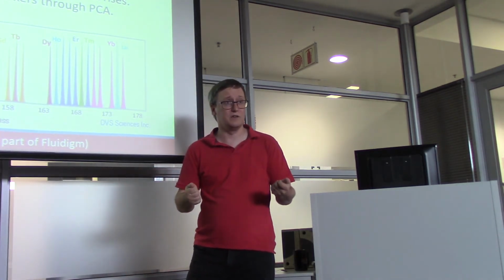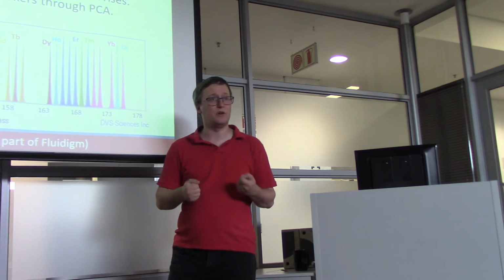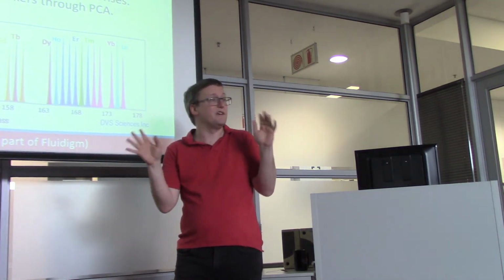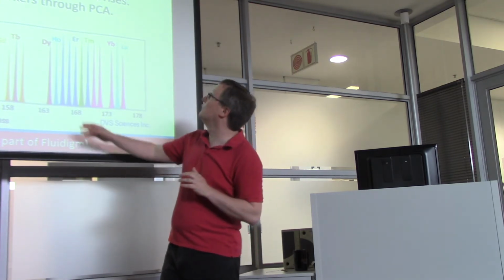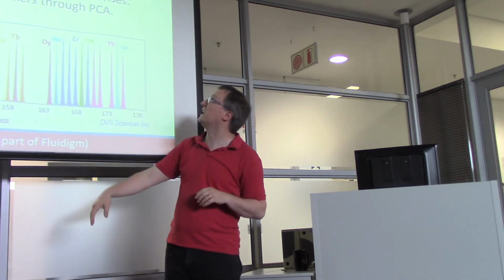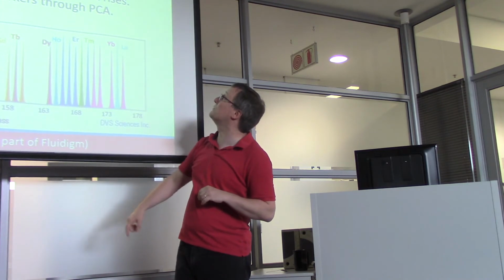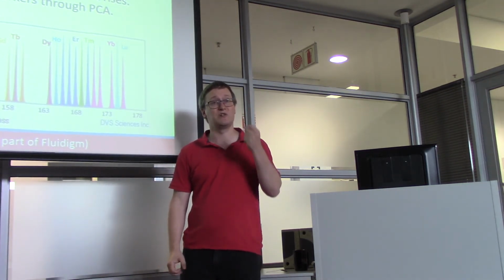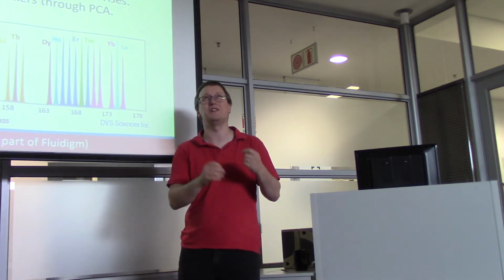These metal markers, when measured in a mass spectrometer, mean that instead of limiting ourselves to maybe 10 different fluorescent dyes, we're instead able to measure upwards of 20. I guess when I produced this poster, it was already possible to measure 30 different markers within these cell populations.